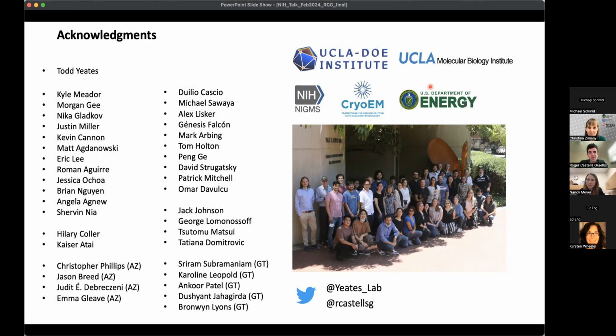but it was also because we collected the data at different times, and new tools were appearing. There were updates in the software too. But for example, for the KRAS, we solved 4 or 5 different structures for different mutants. So once we had one specific protocol, we could apply it quite quickly to the others, which is very nice because it would shorten our processing time to just a few days or weeks.